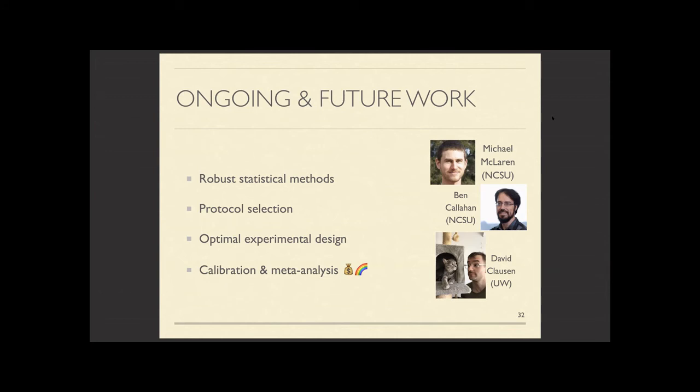So how do you choose between them, particularly in conjunction with some methods analysis plan that you have? Similarly, how do we use positive and negative controls data to estimate these efficiencies? And the ultimate long-term goal is to be able to do calibration of biased 16S sequencing data to get unbiased relative abundance estimates from this data, and also to allow us to do meta-analysis, so comparing data across multiple different studies, which would allow us to really do validation and, I would say, science.